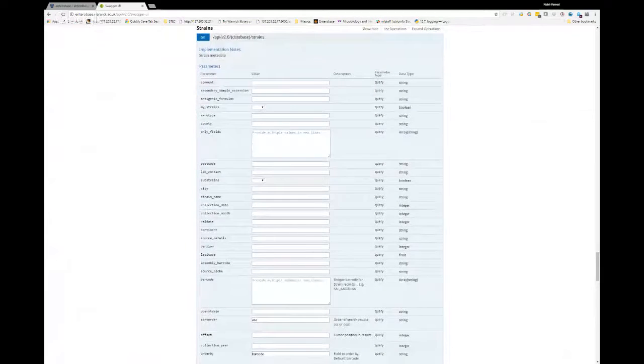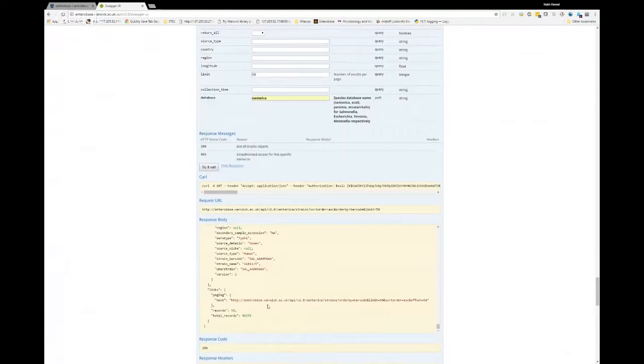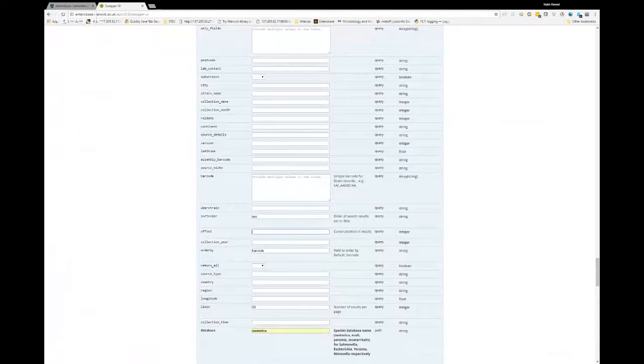Yeah, so same thing I demonstrated, though, with only fields that you give as a comma delimited list. The other thing to keep in mind is you do get the pagination with the links component in your response. So if I just ask for a page, the links here are for the next set of data, which is fine. But if you want to manually jump around, you can pass an offset value, offset equals 1000, to jump to the thousands in the search results if you wanted to.